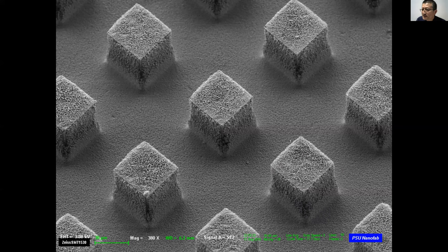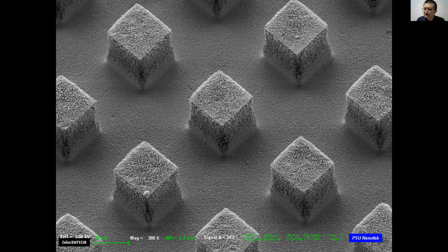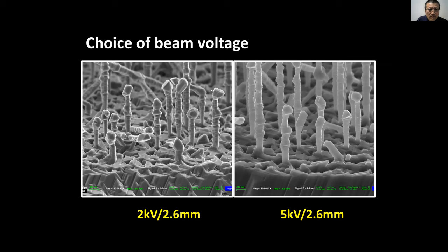Here's another example — a fabricated silicon device structure. With SE2 you can now see the real three-dimensional sense of the device. The shadowing effect from SE2 reveals the actual morphology of the structure clearly.